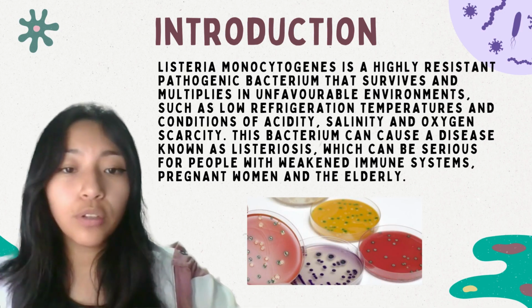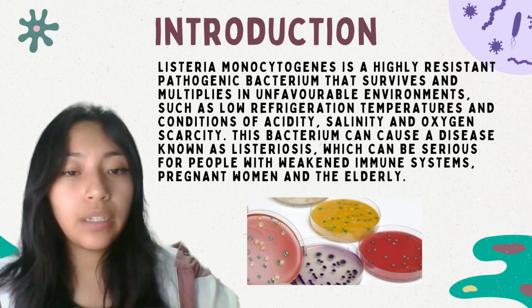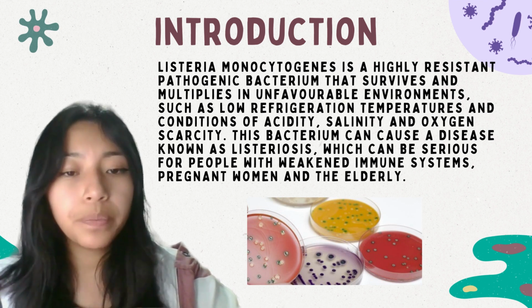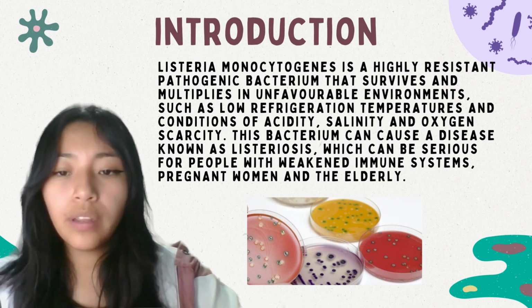On this occasion, we are going to present a video report of our first microbiology practice about the determination of the presence of Listeria monocytogenes in sensitive food matrices. Listeria monocytogenes is a highly resistant pathogenic bacterium, as it survives and multiplies in unfavorable environments such as low refrigeration temperatures and conditions of acidity, salinity, and oxygen scarcity.